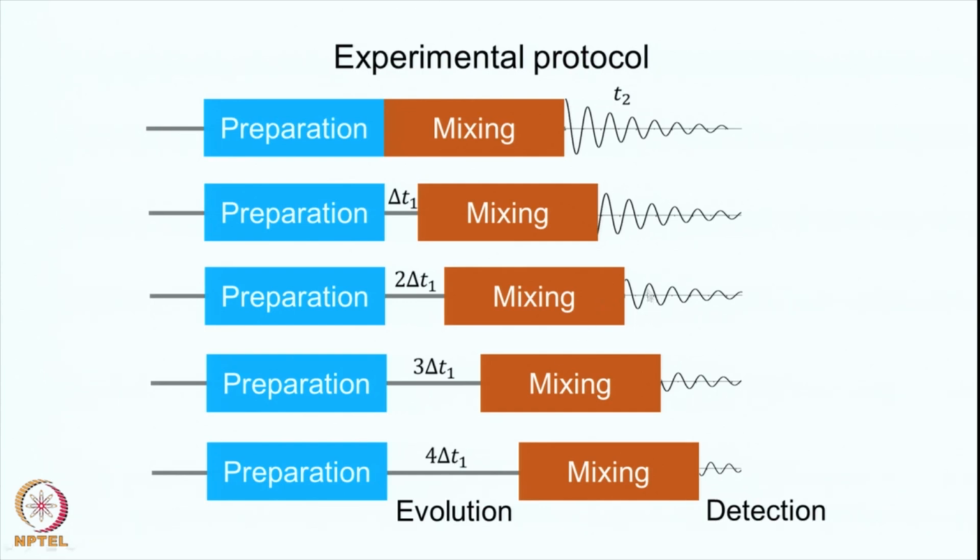Of course, you remember that this FID is collected as a function of time in a digitized manner. Although it is shown as an analog signal here, you actually collect various data points in a digital manner, as in Fourier transform NMR. So, here you are also generating time, systematically incrementing it.